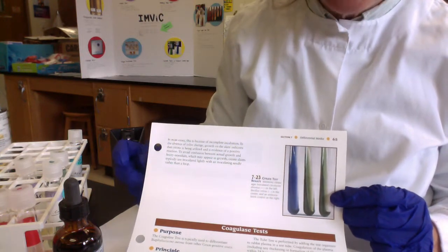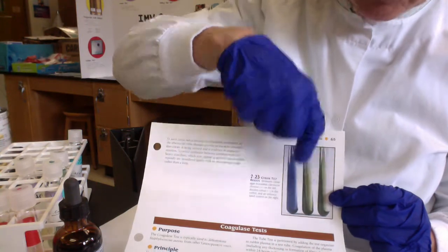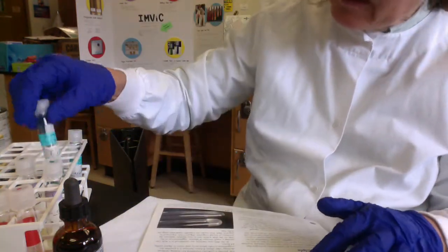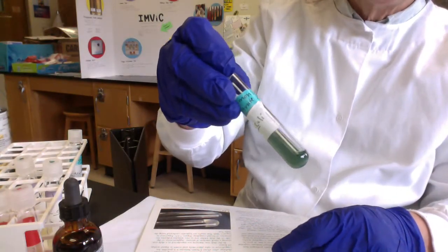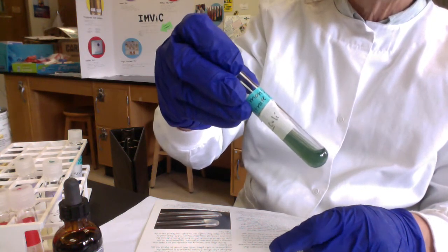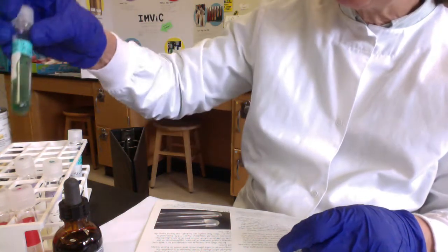And if our microbe can't use citrate as a sole source of carbon and energy, well, the medium will just remain green. So let's take a look, folks, at our little E. coli. And you can see this is after 48 hours of incubation. The medium is still green. So E. coli is citrate negative. Can't use citrate as a sole source of carbon and energy.